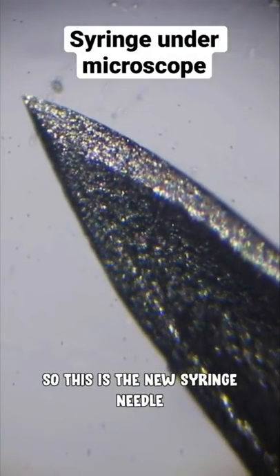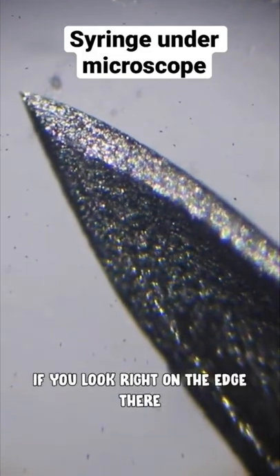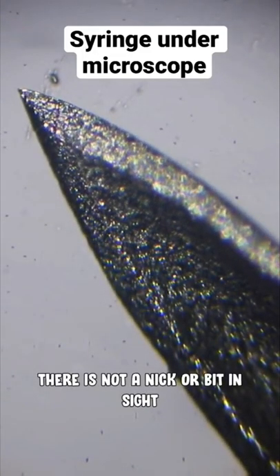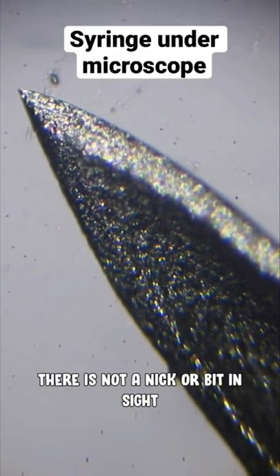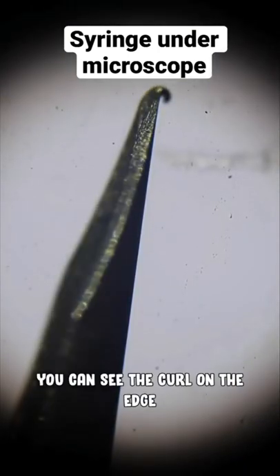So this is the new syringe needle. You can just see the point on that is absolutely perfect. If you look right on the edge there, there's not a single nick or bit in sight. So we've just loaded up the used needle onto our microscope, and you can see the curl on the edge on that.